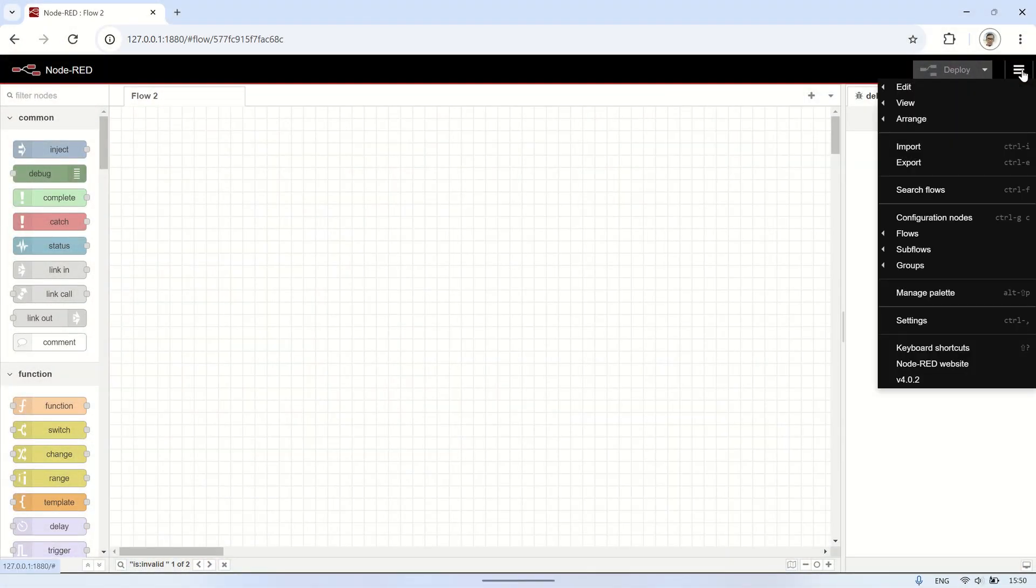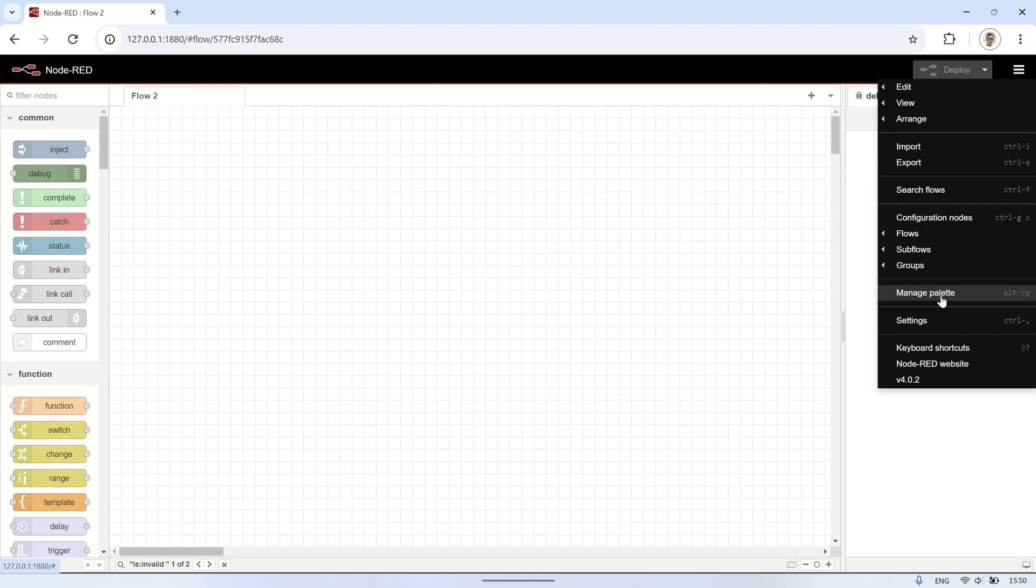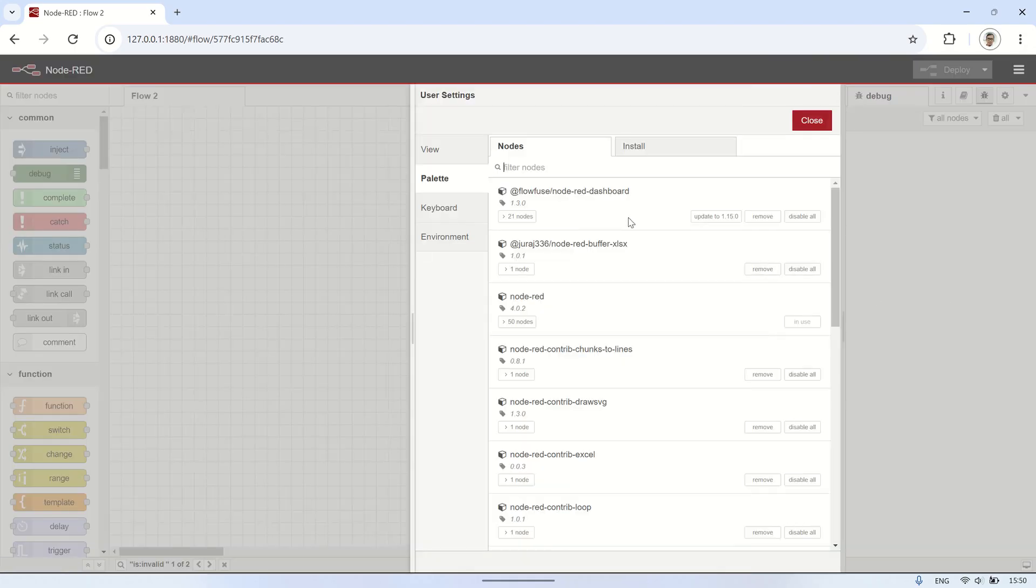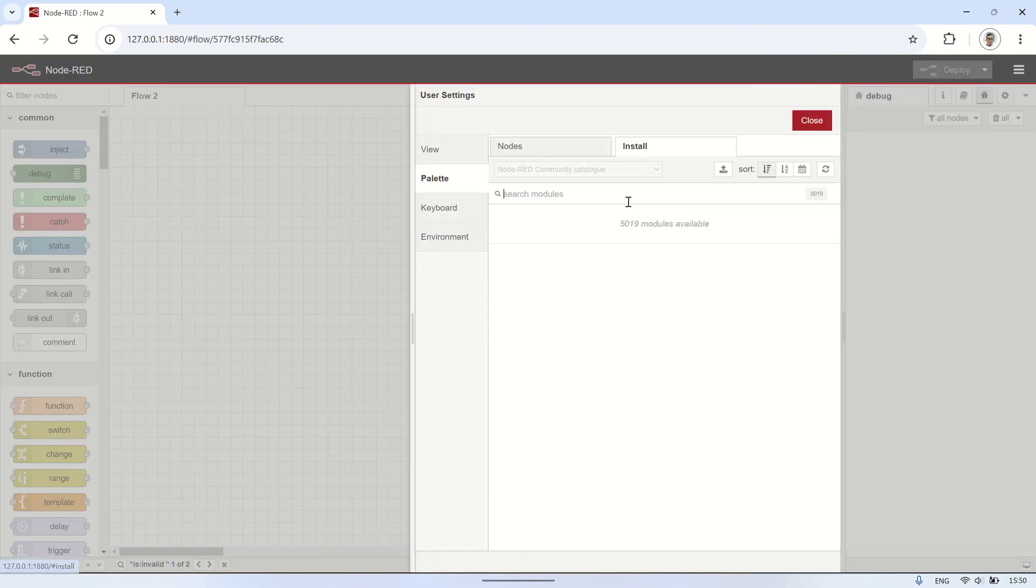To communicate with the balance using serial, we first need to install the node-red-node-serial-port in the Node-RED interface under the Manage Palette section.